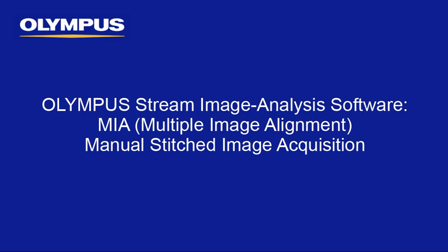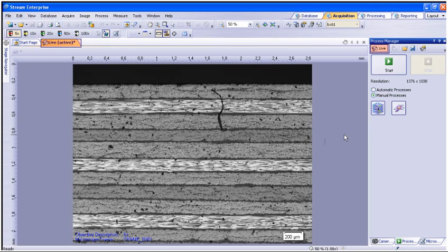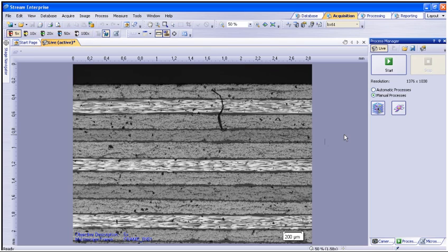Manual MIA is available within Stream Essentials, Motion, or Enterprise. To begin, you will need to have a live, well-focused image on the screen and set the magnification you desire. To create a more uniformed, stitched image, utilizing a manual exposure or locking the exposure and shading correction are required.